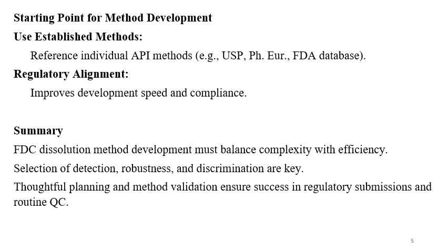Regulatory alignment improves development speed and compliance. So if you are using those methods, you can try with the existing methods, then you can make the necessary changes as per the formulation, and then you can set the dissolution method for FDCs.